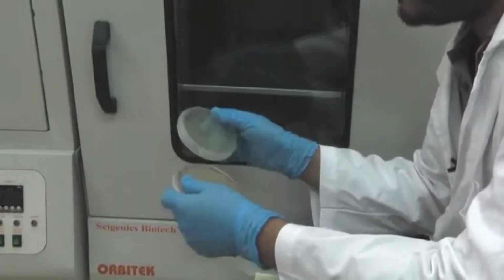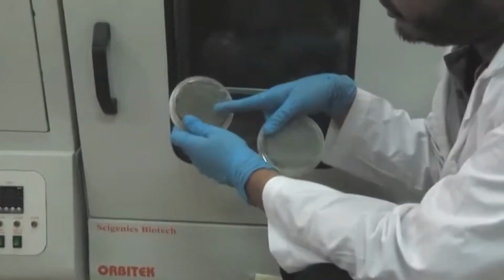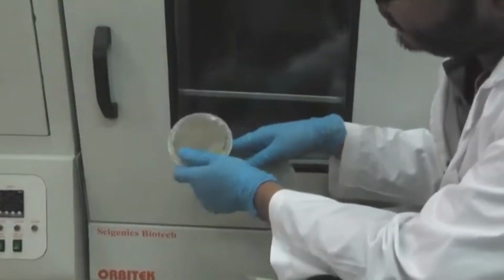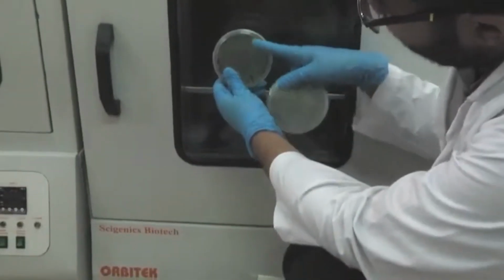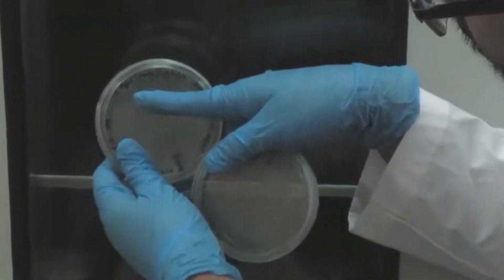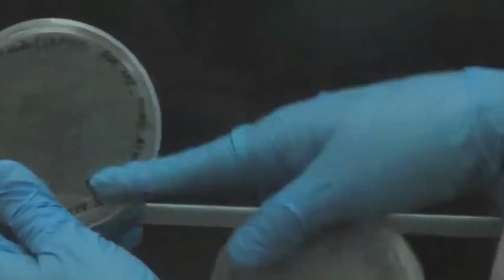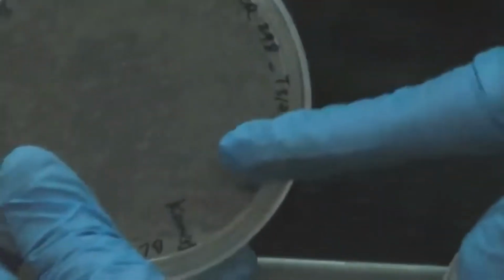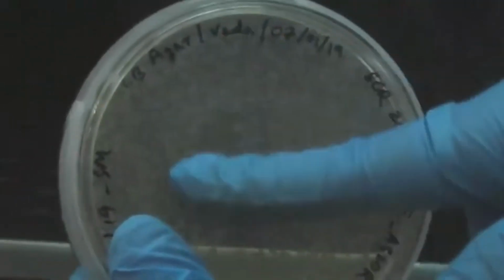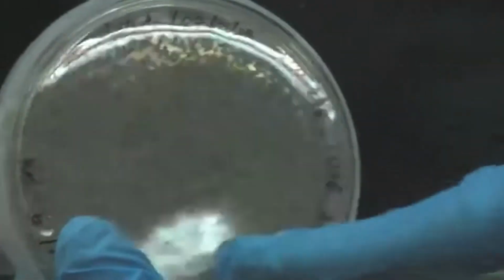These are the two plates. We had plated 200 microliters here and 20 microliters here. You will notice that in the 200 microliters, the number of colonies is much more, and also many of the colonies are very small because of the space crunch. There was a lot of transformed bacteria, so in 200 microliters there is more culture and more bacteria, and in this limited space they could not grow as much as these in the 20 microliters.